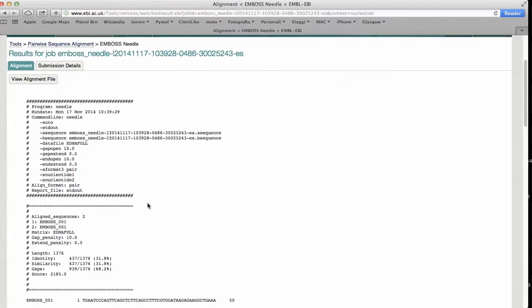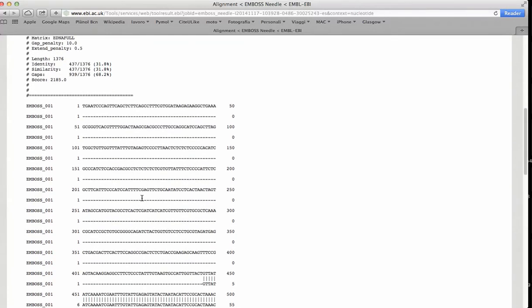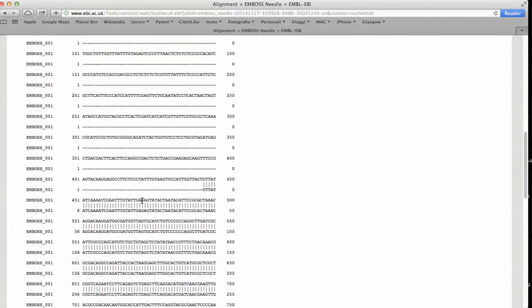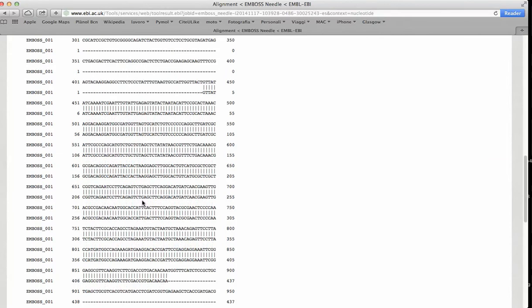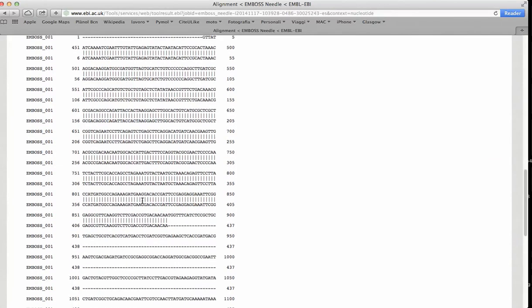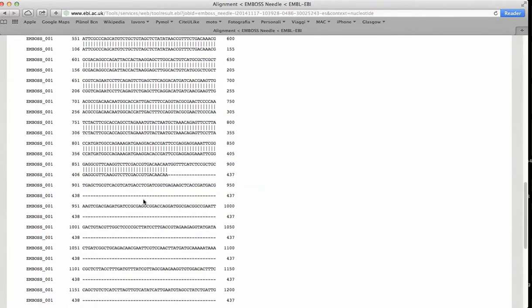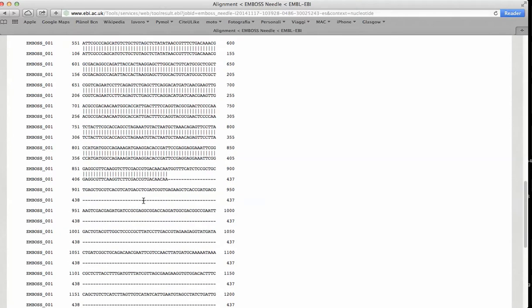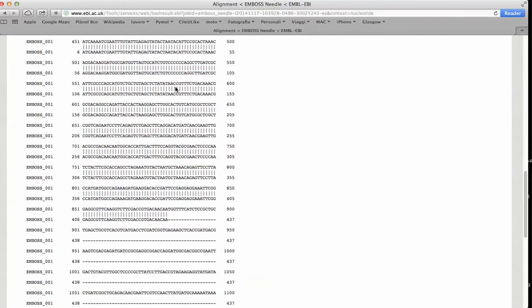Here is the result of our alignment and here is the alignment. In this example, we observe that there is a region when the sequence align perfectly.